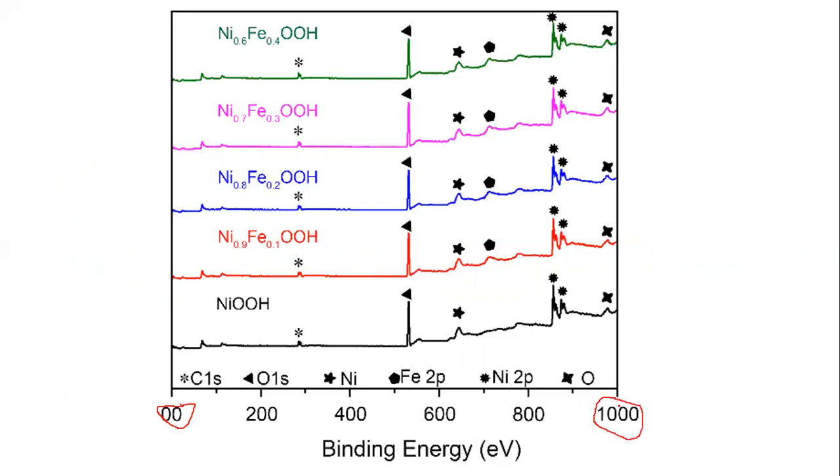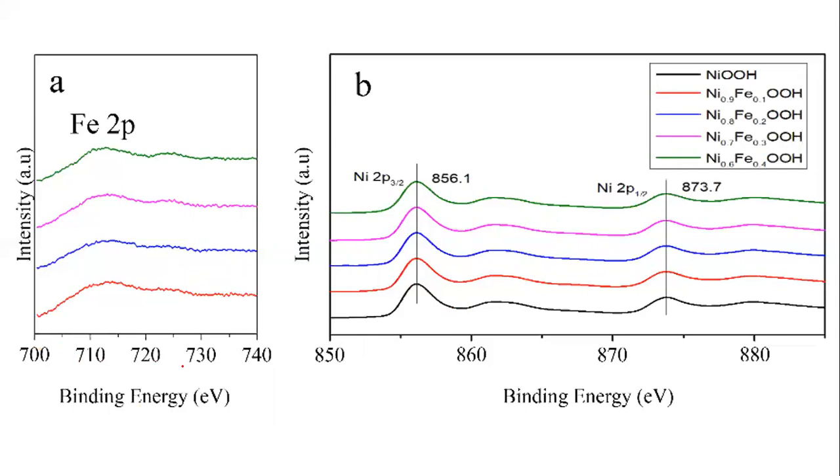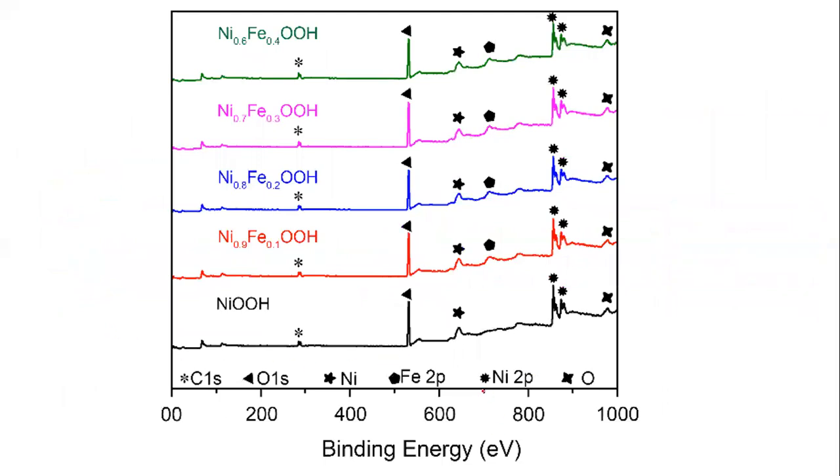Now the next one that I'm going to show you, I want to zoom this portion. The reason for zooming this portion is that I want to confirm whether there are any changes over here. So when I zoom this portion, you see from 700 to 740. And coming back here, this is 700 and that is 800, so it lies in this range, 700 to 750.